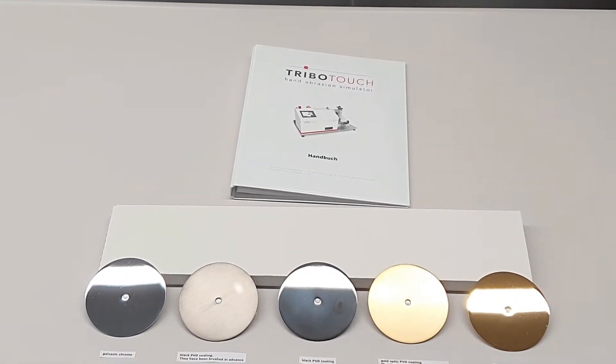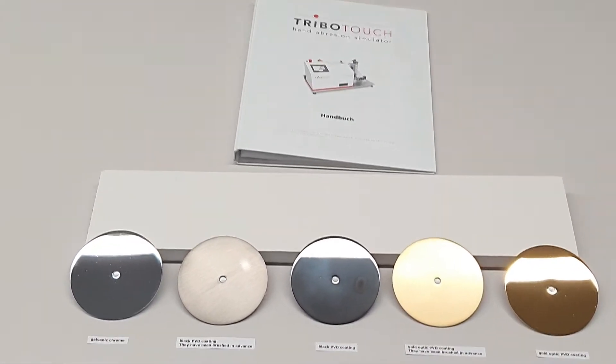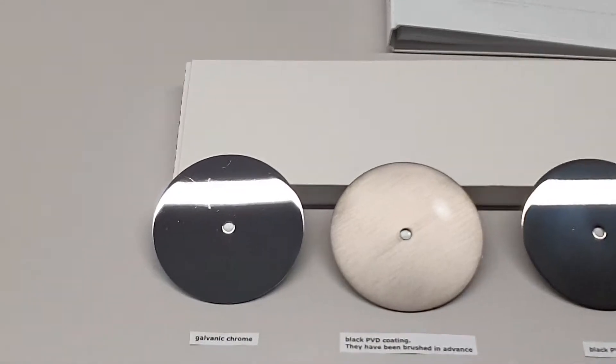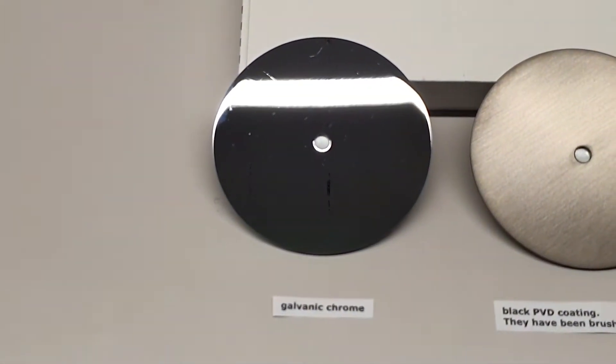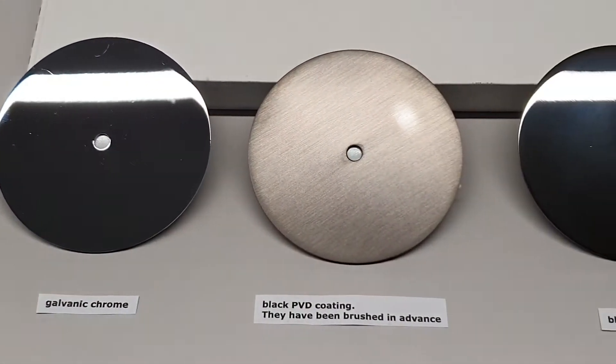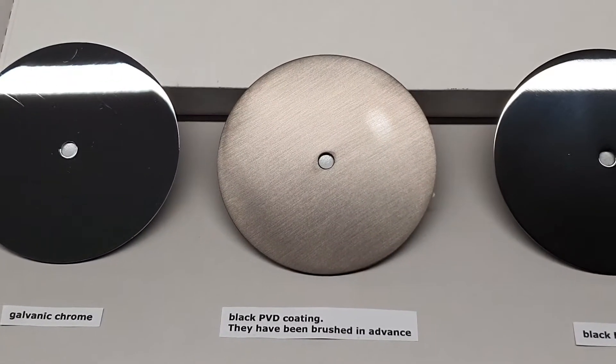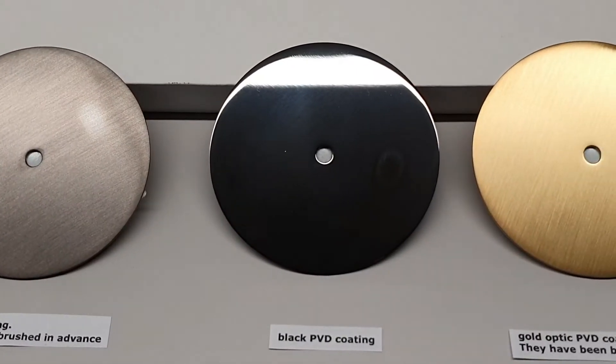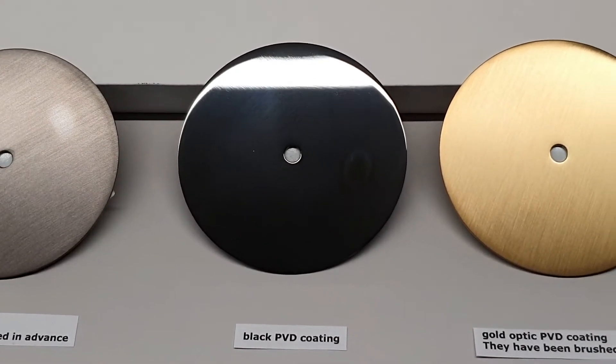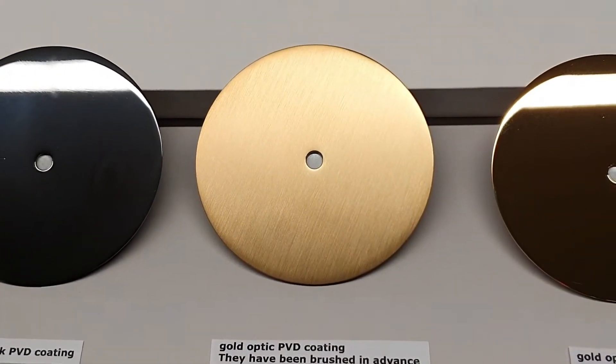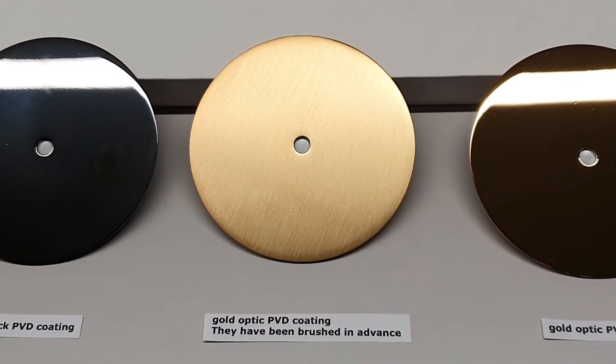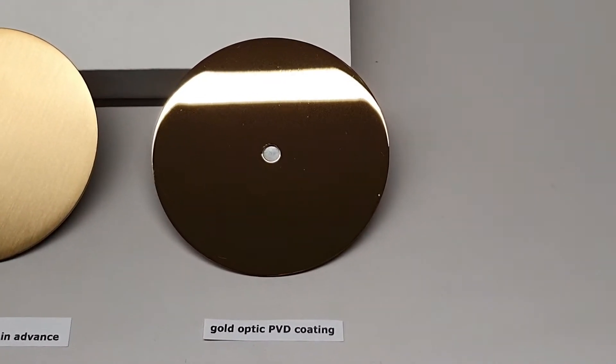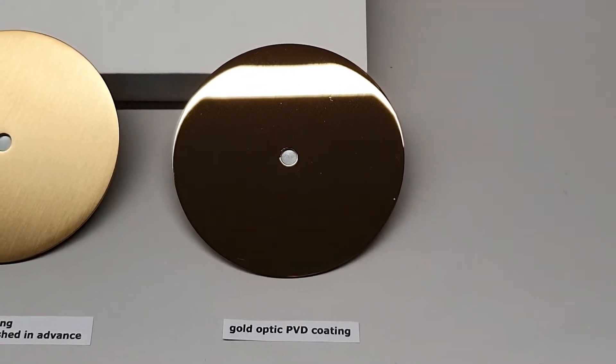We have performed the hand abrasion test on five different samples: standard galvanic chrome, PVD coating on a brushed surface, high gloss PVD coating with black appearance, gold optic PVD coating on a brushed surface, and high gloss gold optic PVD coating.